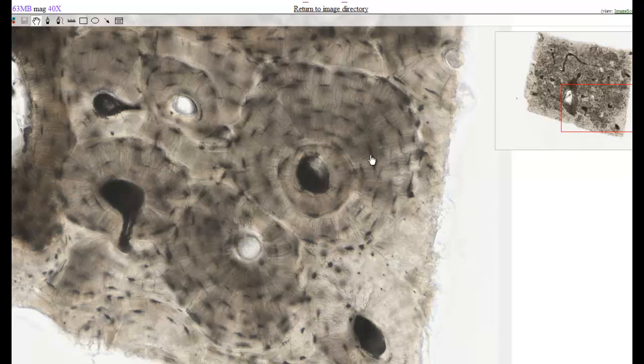Now, you see these little dark structures there? Those are the lacuna, or lacunae, I should say, and we can imagine osteocytes within them. Okay? Now, admittedly, we don't really see a great structure of an osteocyte, but I do want you to know what is there. That is a lacuna, and an osteocyte would be anticipated to be residing within a lacuna.